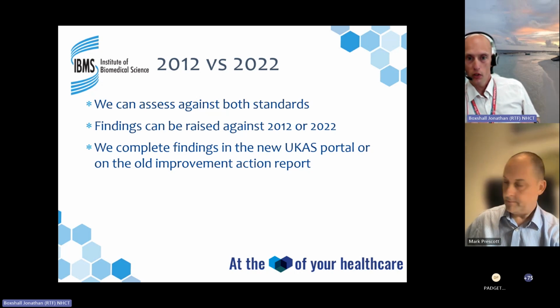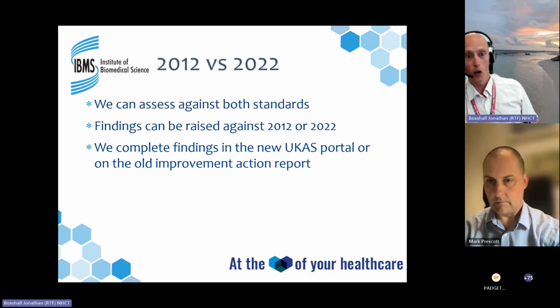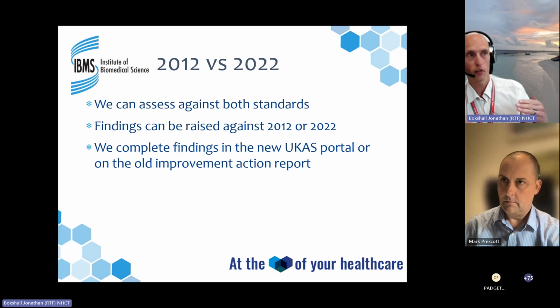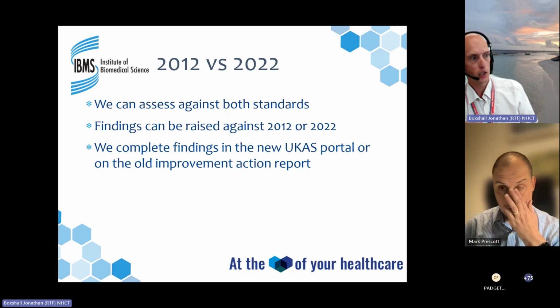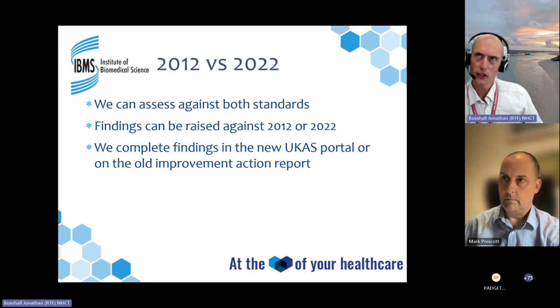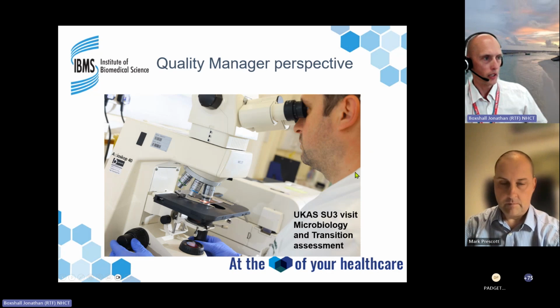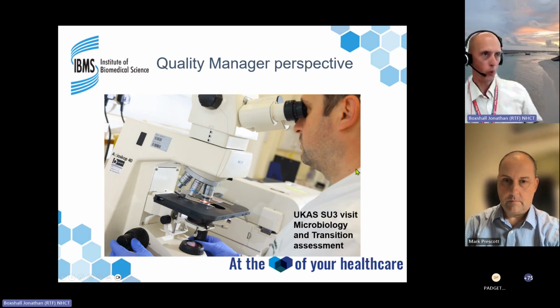And as anyone who's been through a visit will know, we have to complete a portal. The portal goes for this normal surveillance visit, which is the new UKAS portal. So we'll create our findings in there with the improvement actions, and the transition. I've got that the right way around. No, the transition goes on the old paperwork, I think, which is the spreadsheet one with the findings on. So you'll get them separately. That's how we've worked through it.